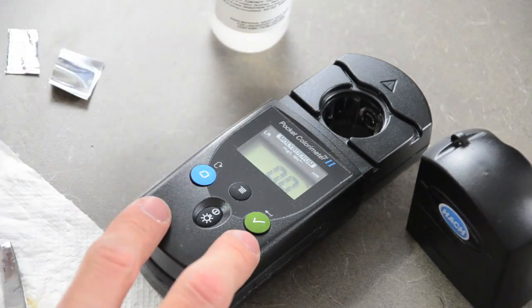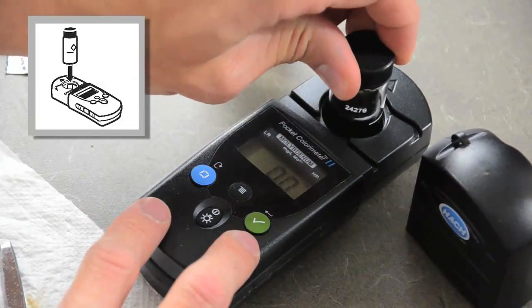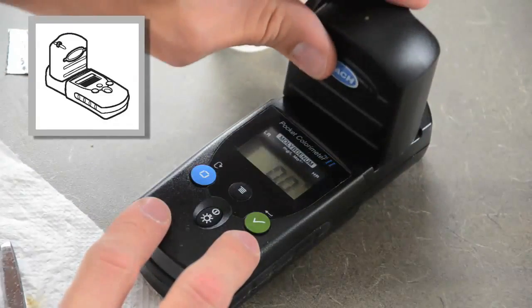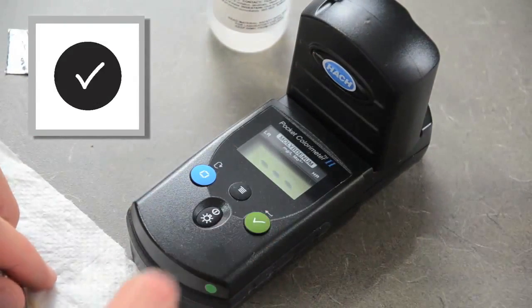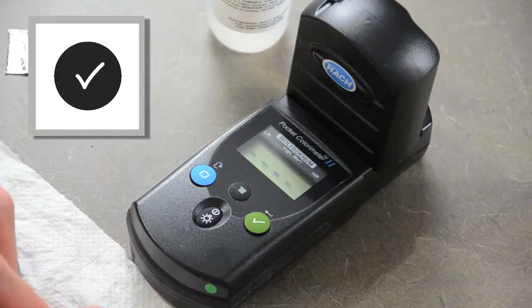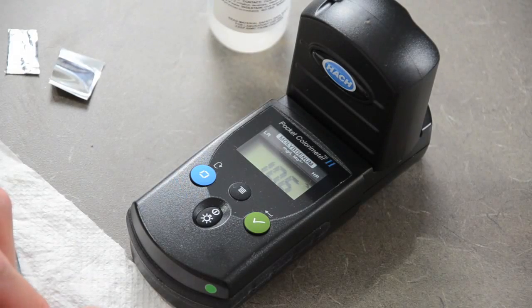Place the prepared sample in the cell holder. Cover the sample cell with the instrument cap and press the read/enter button. This sample reads at 10.6 parts per million.